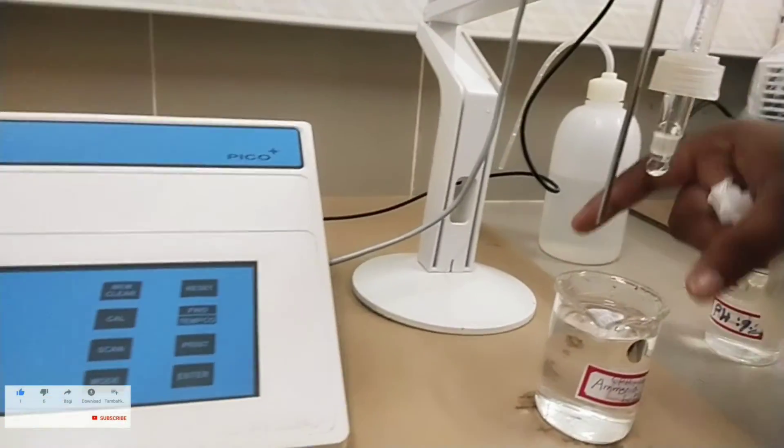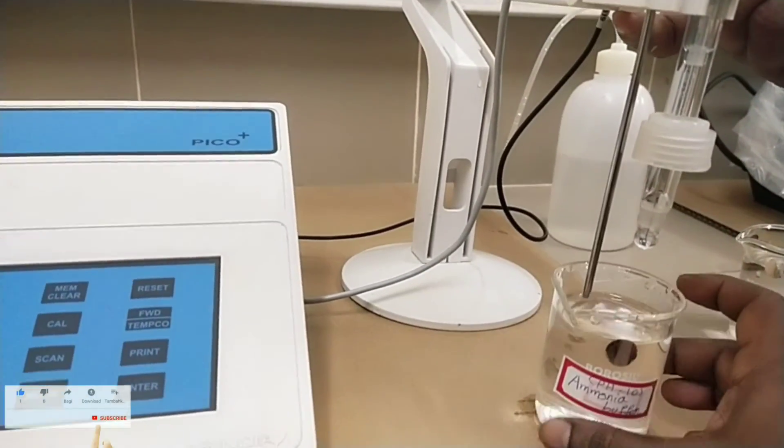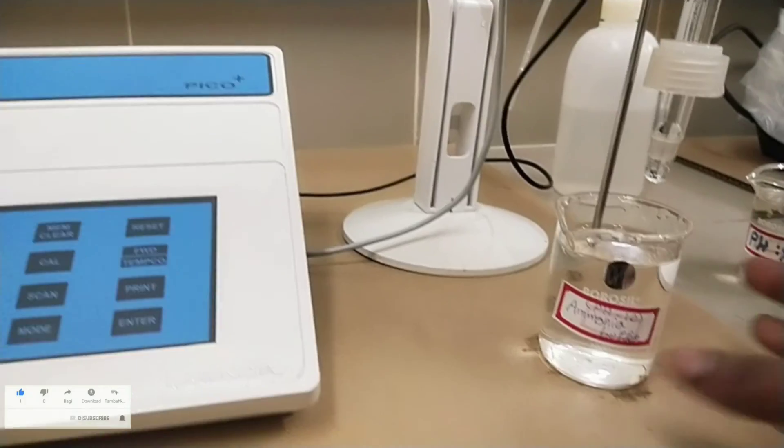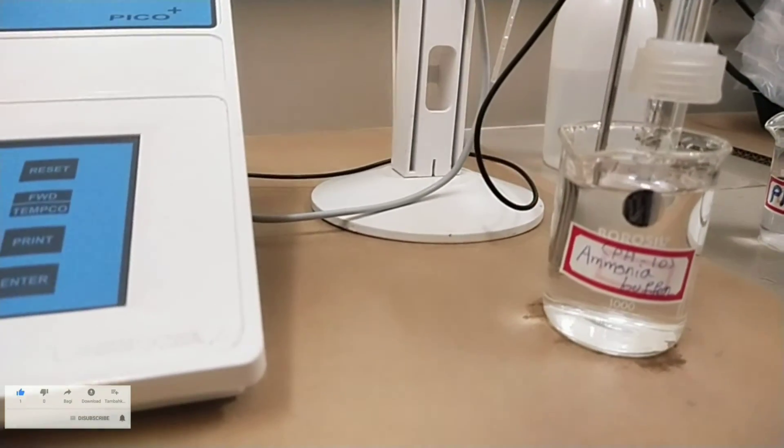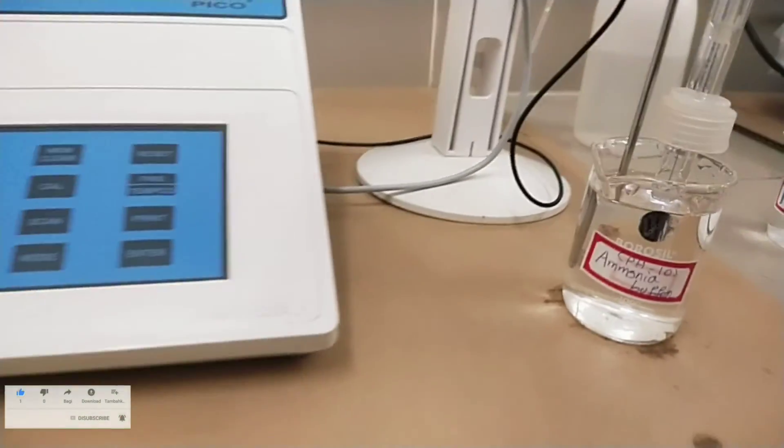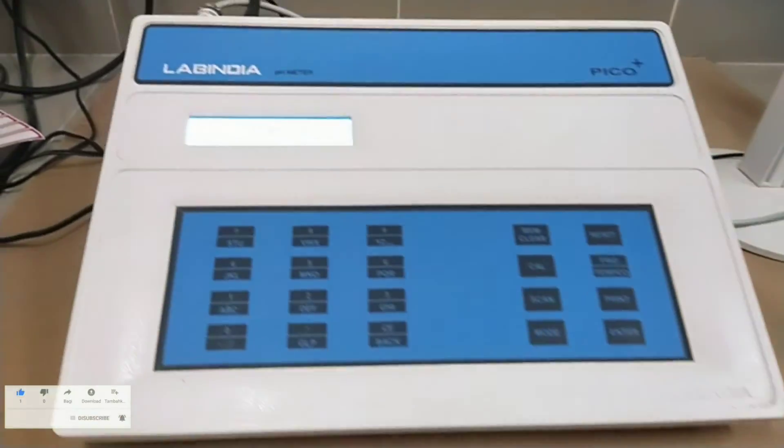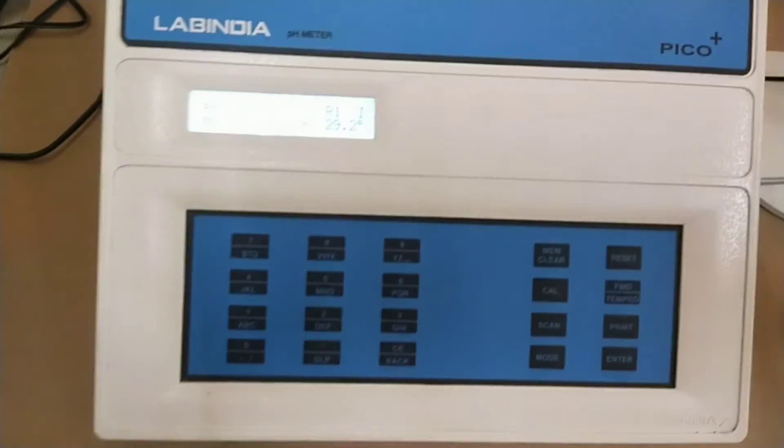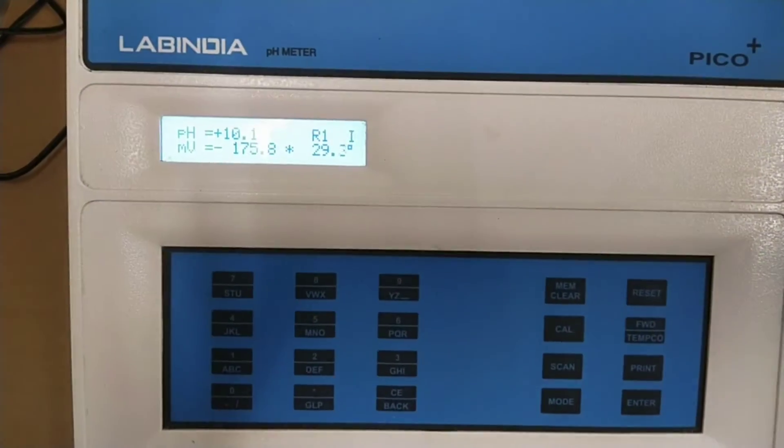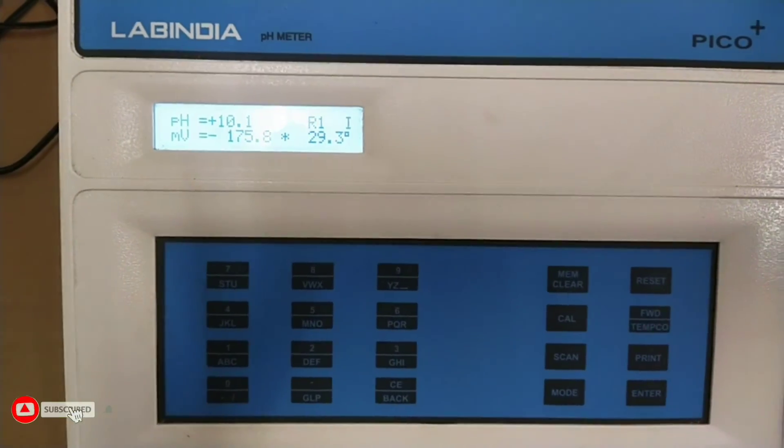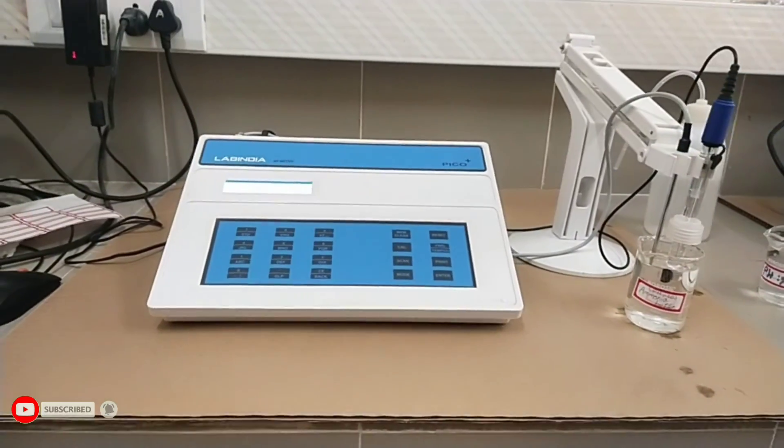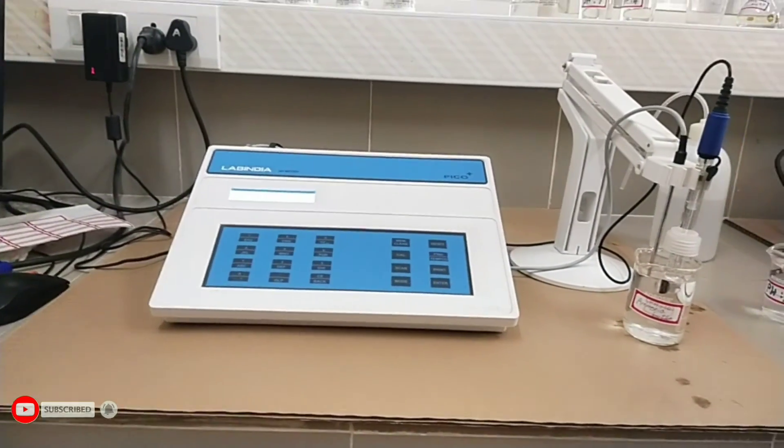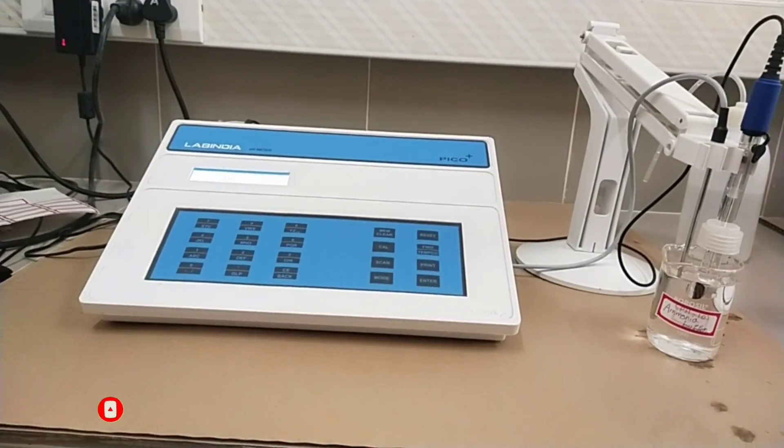Today we are going to measure the pH of ammonia buffer. Remove the pH electrode from the solution and rinse it with distilled water. Soak the excess water with tissue paper and insert the pH electrode and temperature sensor in the sample beaker. Now display reads the sample pH.